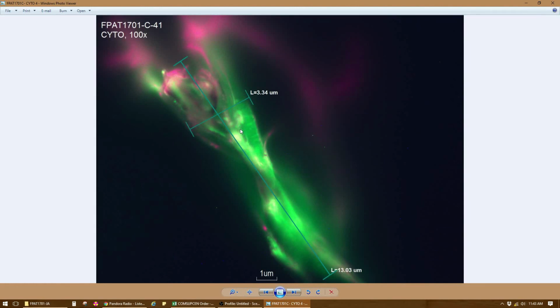So you can actually piece together several different images to represent one image that's in focus, kind of like doing confocal imaging, if you've never seen that. But for our purposes, just trying to get in focus what you think is the most important aspect of that object, and then taking the image off that.